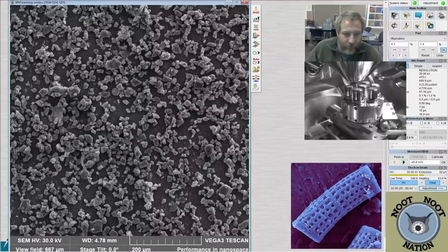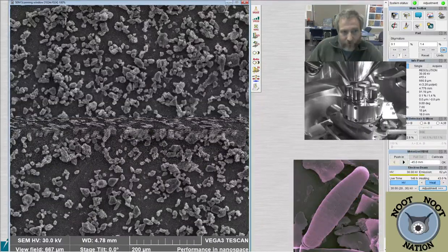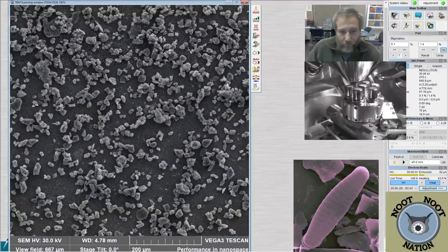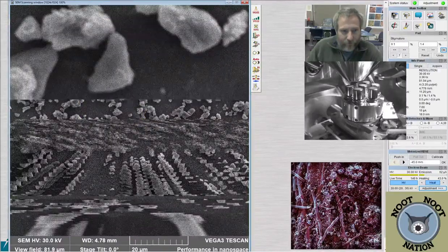Typical lake sediments are a lot different. They're usually dominated by diatoms, so we don't have to go very far in our slides to actually see anything useful or interesting. Here we go, we got a little round guy.